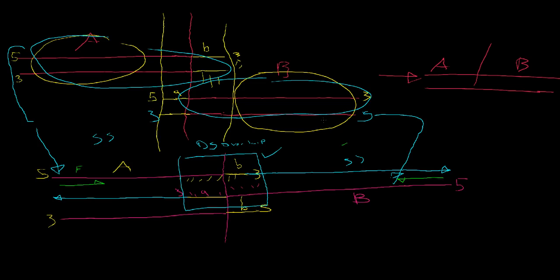So they could potentially bind to our original templates up here, but they're not going to be able to create a chain reaction. They can only extend once in these original template fragments. They're just going to poop out there. There's no other oligos that are going to be going that way. But in our sewing by overlap extension case, they can amplify one another.